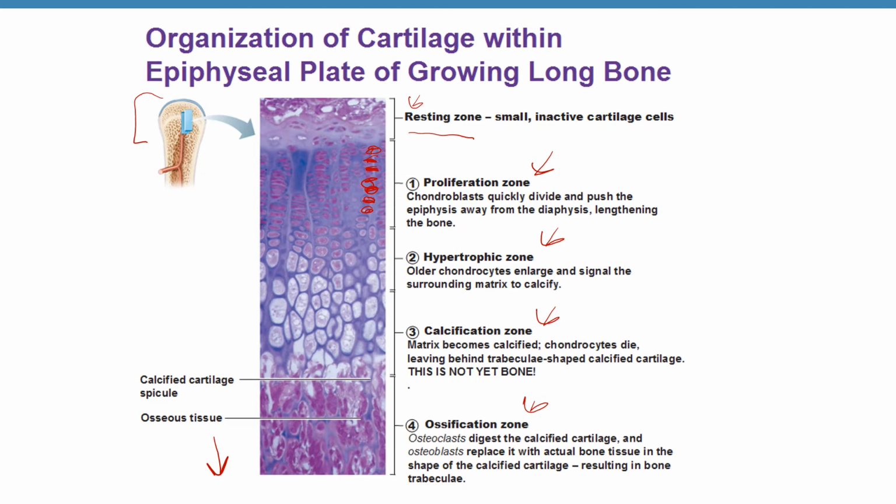So chondroblast over here stop dividing, right? So here we had chondroblast. Now they stopped dividing and became chondrocytes, and they increase in size. So now you see big cells, and lacunae also getting larger. And then they start secreting minerals, right? Calcium.